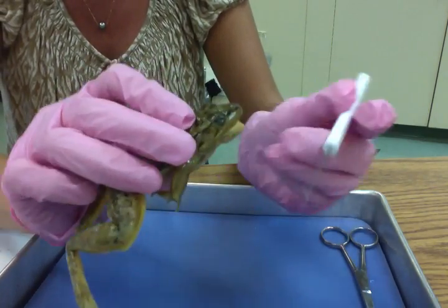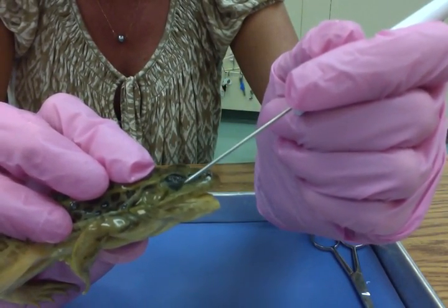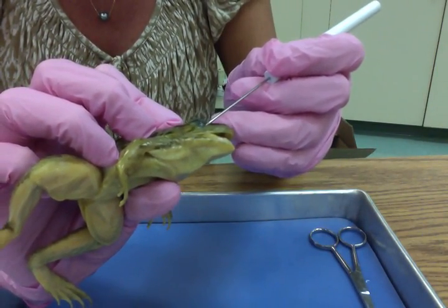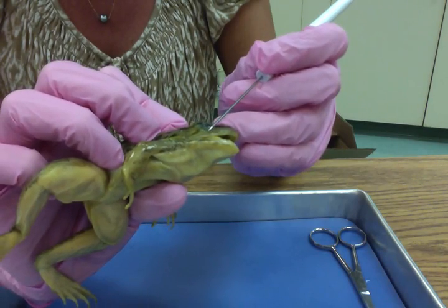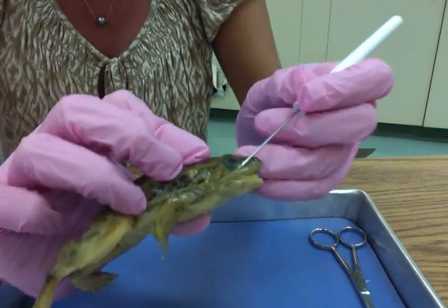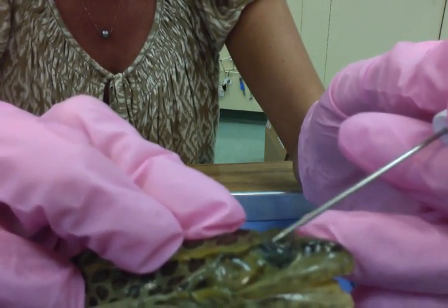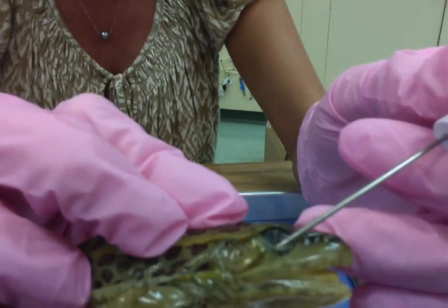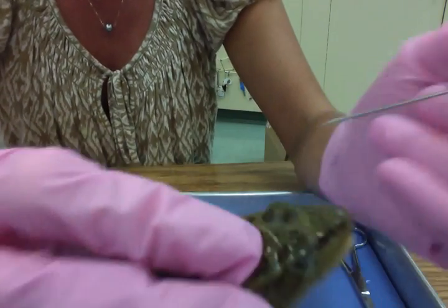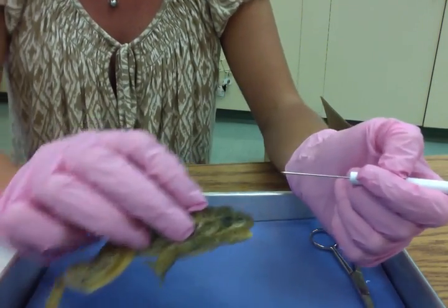And then another thing that I kind of want you to look at is on the eyelids here, there's kind of a thin, clear membrane. So you can kind of poke at it. You'll see that it's just like a real thin flap of clear skin over the eyeball. So you can see it moving around there. That's just a thin membrane that covers the eyeball. It sort of acts as goggles for the frog. When they go underwater, they can see clearly.